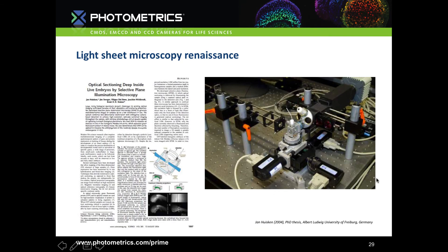It was the work of Jan Huisken and Ernst Stelzer back in 2004 that brought lightsheet back, creating Selective Plane Illumination Microscopy, now shortened to SPIM. You can see the lightsheet coming in from the left, the sample chamber with the sample suspended above for full XYZ and rotational movement, and the detection objective on the right leading to the camera.